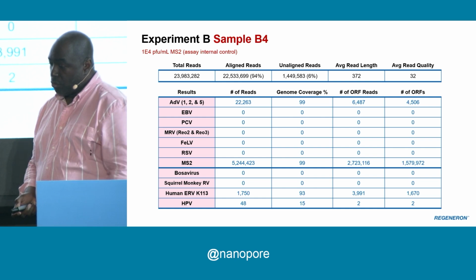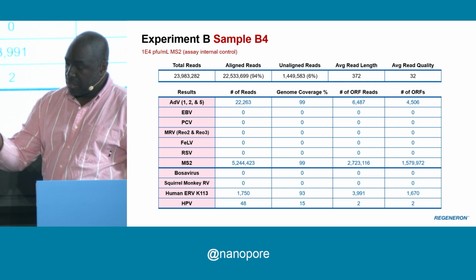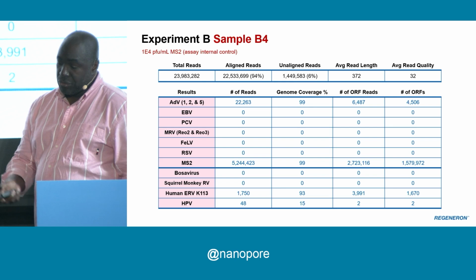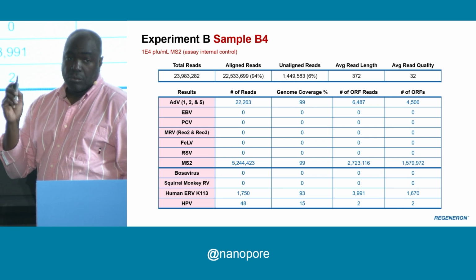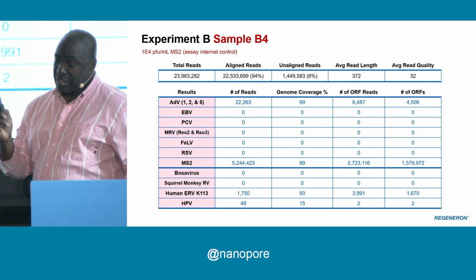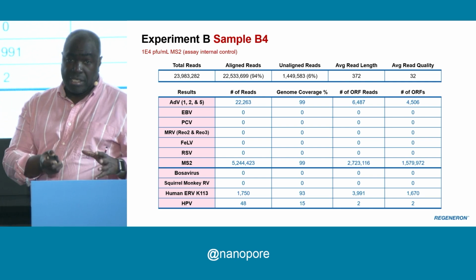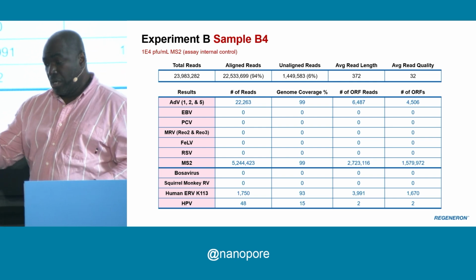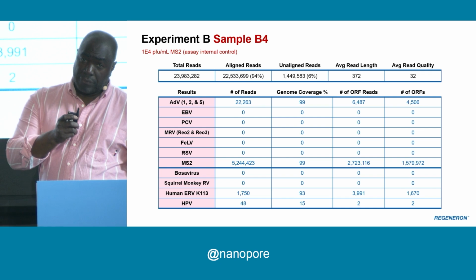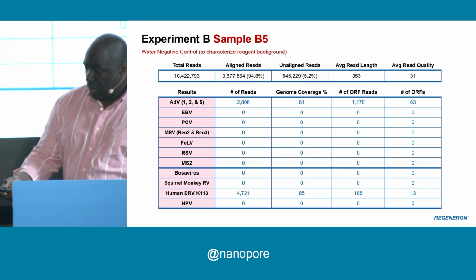And so this is also now the water sample. When you see the water sample, we're still having this adeno contamination into the water. So this is really a challenge that we are going to have with testing samples that have high background. If it's in the vaccine, it will be high background. Vaccine might show up into the negative control. Or if it is a viral vector, the viral vector might show up into the sample.